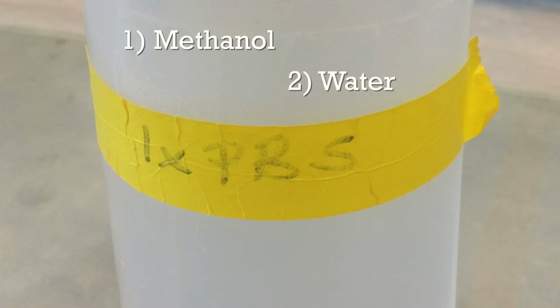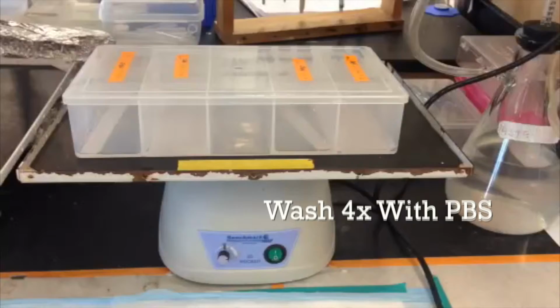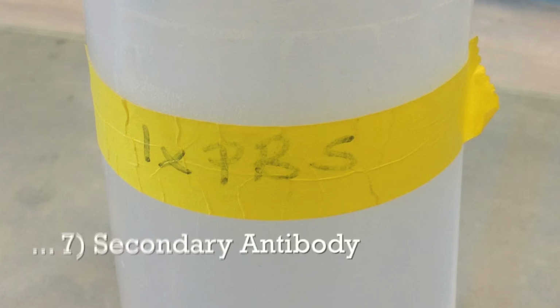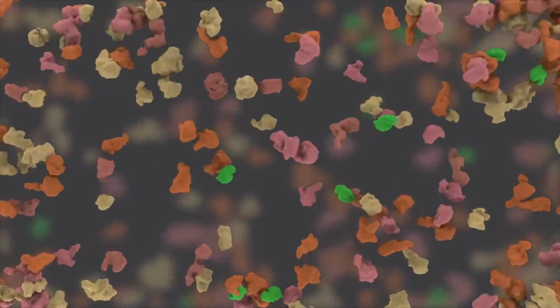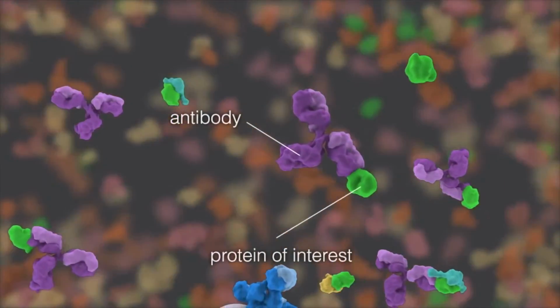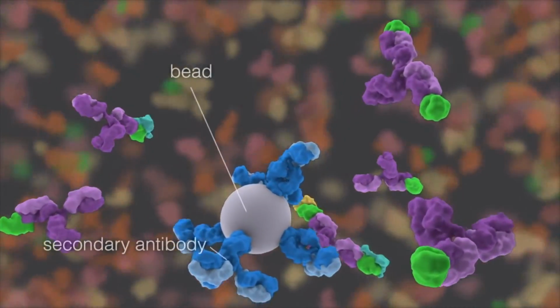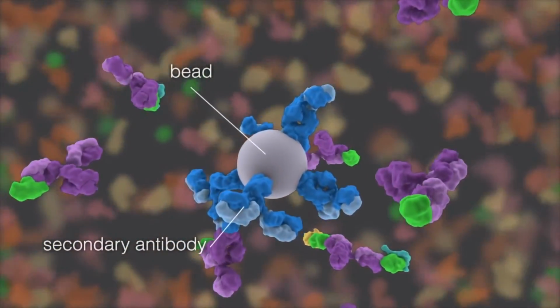Place in methanol, then water, then sodium hydroxide, water, PBS, place in primary antibody, wash 4 times with PBS, place in secondary antibody, and wash 4 times with PBS again. That was a mouthful. The antibodies are used because they help distinguish the target protein. Primary antibody attaches directly to the antigen. Secondary antibody attaches to the primary antibody with a fluorophore.